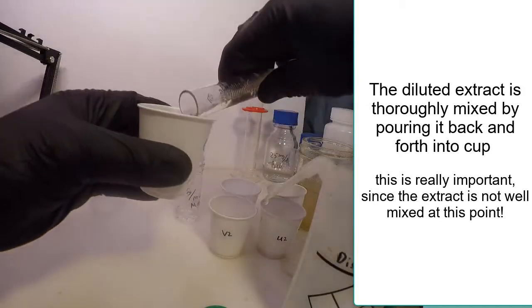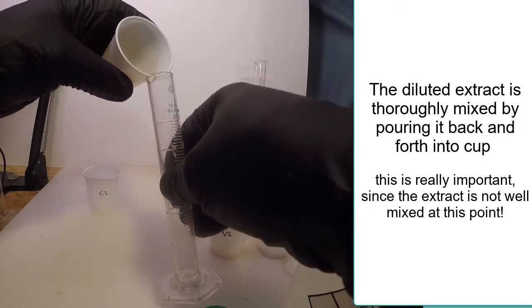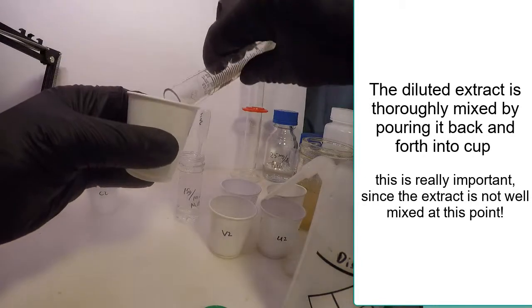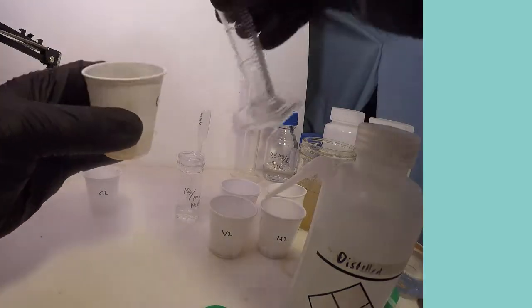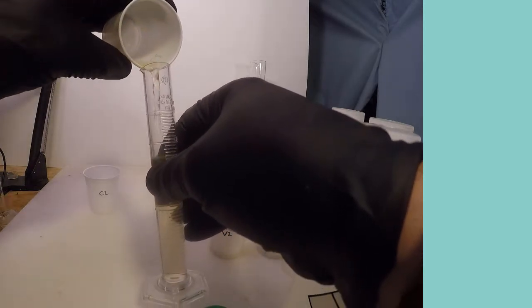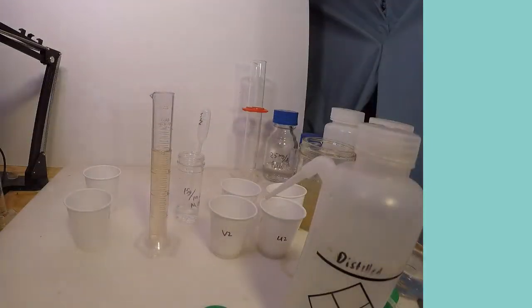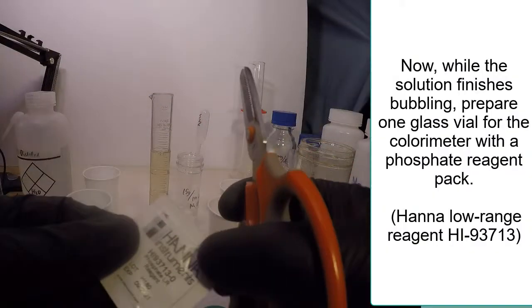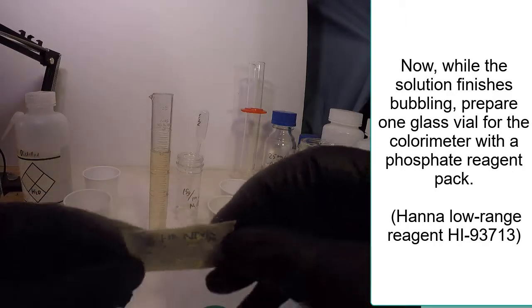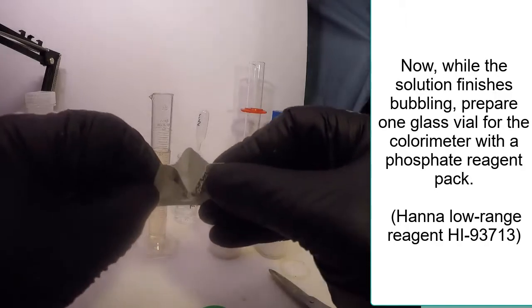The extract and diluting water need to be well mixed before analyzing. While the solution finishes bubbling in the cup or the cylinder, a vial can be prepared with the contents of a reagent pack for the phosphorus analysis.